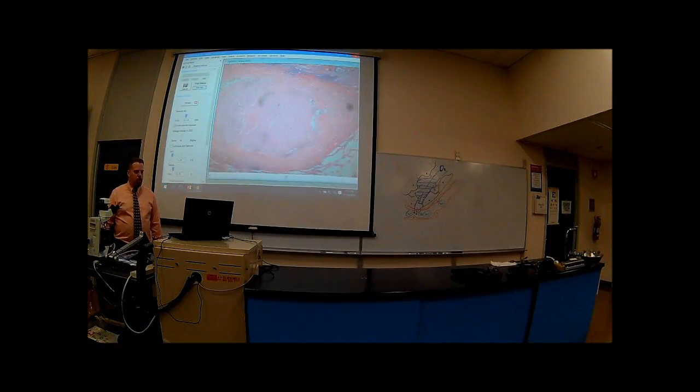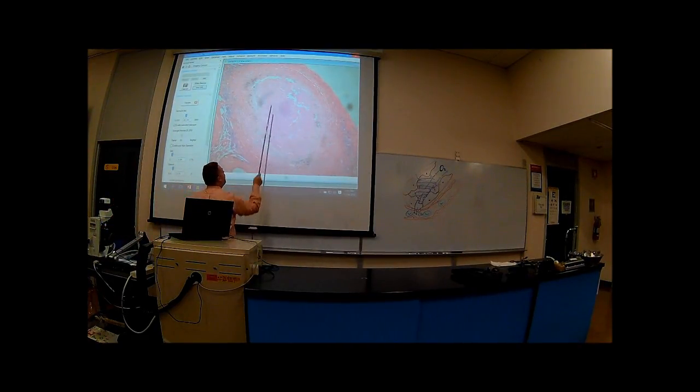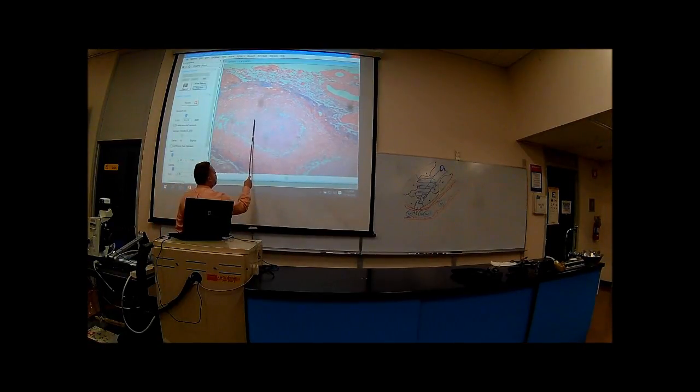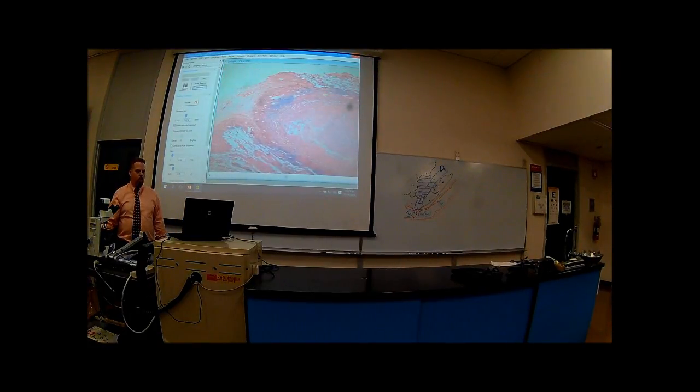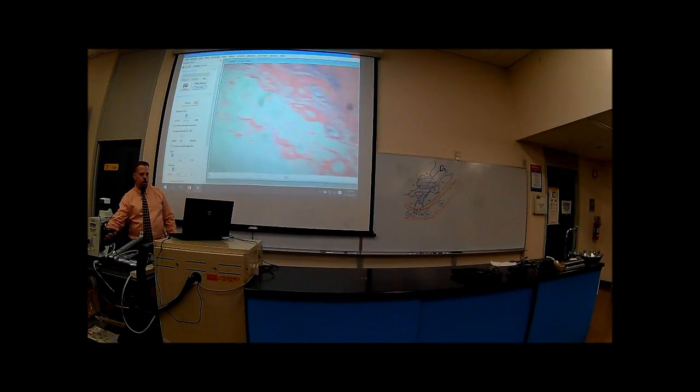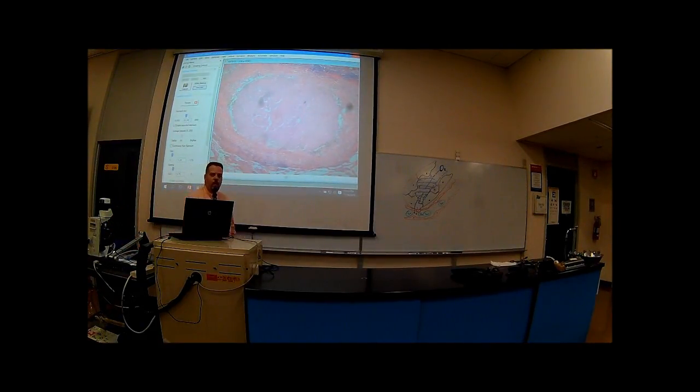I think there's a few other ones you can see on this particular case. It's another blood vessel. More blood vessels. There's another tubercle right there. See it? Bacteria, and then it's walled off over here. Okay, that's another tubercle. There's another one over here, right? Tubercle, and there's the barrier around it. Okay, that's tuberculosis. Right, that's normal lung tissue all through here. All right, that's tuberculosis. Okay, or tubercle right there.